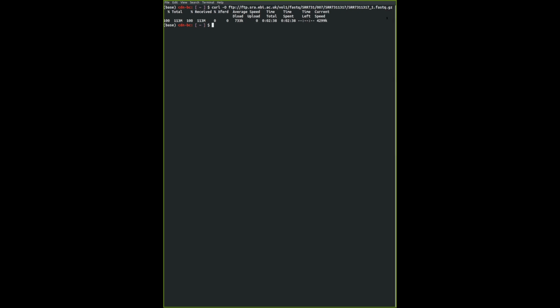So I'm going to just deal with just one FASTQ file right now, and I'll do this slowly, so give a bit of time for others. Okay, so as you can see, it's currently in the home directory. I don't really want it in the home directory, so I'm going to move, and then the name of the file is SRR. I'm going to autocomplete it and put it in the directory I created earlier on, which is RNAseq_workshop. I'm going to autocomplete into originals, autocomplete, and FASTQ, autocomplete, and with capital A, because it's capital A like this.